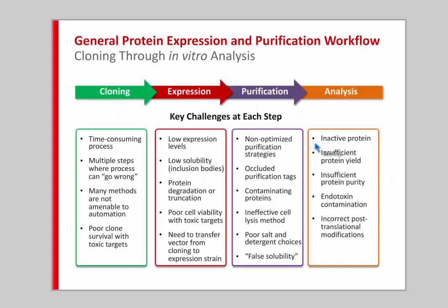And so let's talk about these general challenges. This is an overview of an example workflow which starts with cloning and proceeds to expression and protein purification and finally to analysis. And some of the challenges are listed below each step. And we won't name each of these challenges now, but I imagine one or more of these roadblocks are familiar to most researchers who are expressing recombinant proteins for any application.